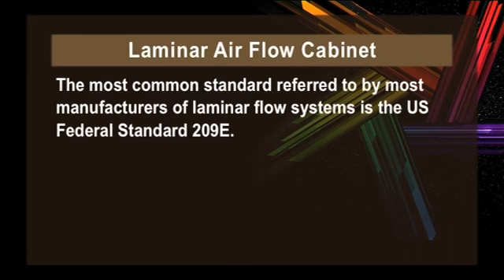Undoubtedly, laminar airflow is the most important part of the laminar flow clean benches to provide an environment free from microorganisms moving toward the workspace with excellent and consistent results. The most common standard referred to by most manufacturers of laminar airflow systems is the US federal standard, that is 209E.